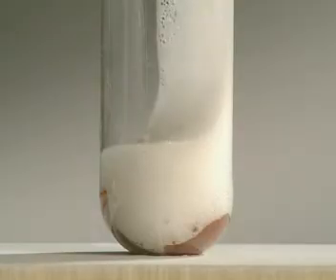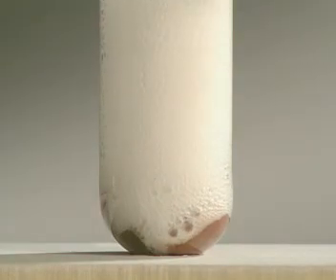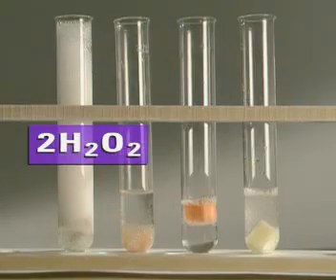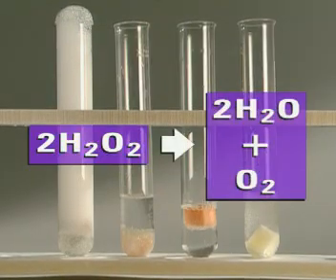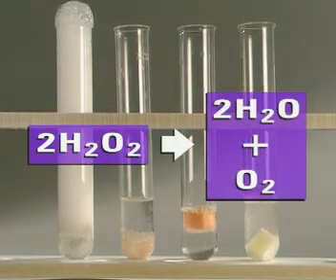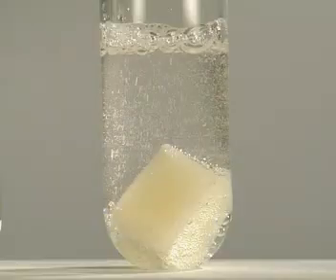Add hydrogen peroxide solution and it begins to fizz. Catalase in the tissues breaks down hydrogen peroxide into water and oxygen. The oxygen escapes as a gas.